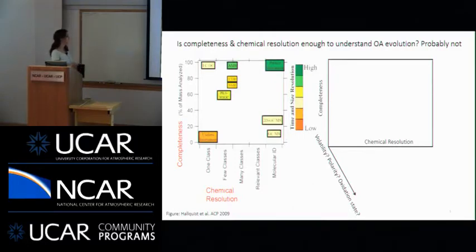So they used to like to point out, if you can only measure one class of molecules, so one small amount with no differentiation or chemical information, and you measure only a small fraction of what material there is, then that is a pretty useless instrument. What you want is an instrument that can give you molecular identification of absolutely everything, right?